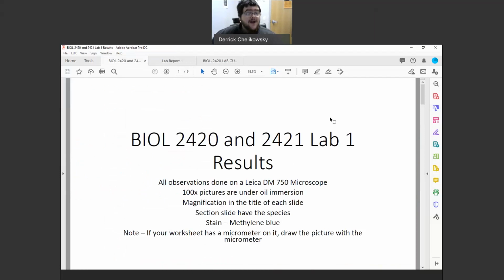As a reminder on the layout of our results documents, all the result documents are going to have a title and then all the information you need on the drop page. If there's more information that you need that can't be fit on the drop page, it will have a go-to on the drop page itself.